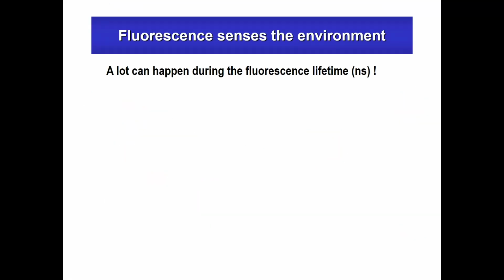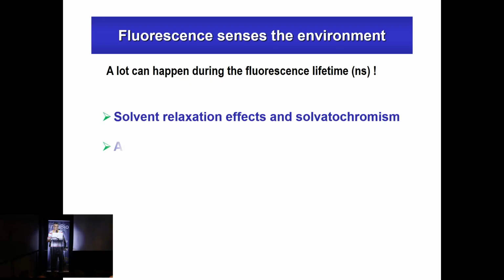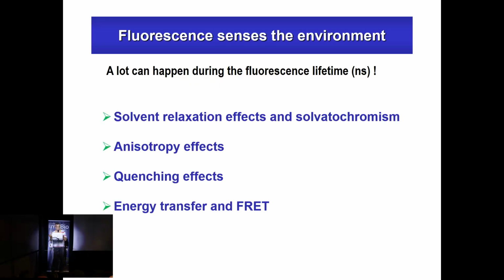So another very important aspect that I touched on already a little bit is that, due to the long lifetime of fluorophores, nanoseconds, fluorescence has the capacity to sense the environment. So there is a long list of experiments that have been designed over the years to take advantage of this sensitivity to the environment.